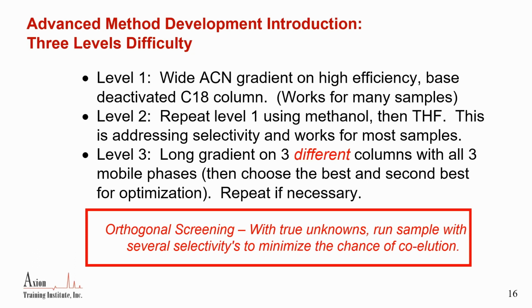The first thing that I say is, let's change the mobile phase. It's the easiest thing to do. It has an impact on the separation. I'll admit the stationary phase chemistry has a bigger impact, but the mobile phase chemistry is a lot easier to change.